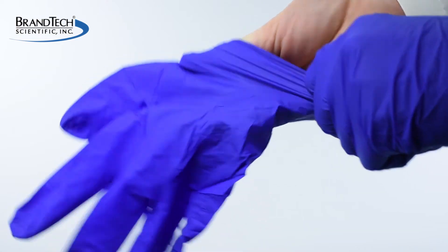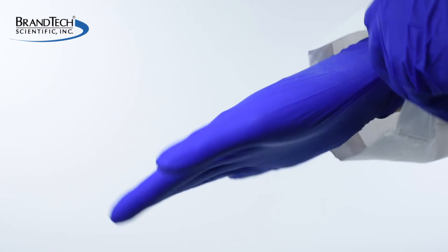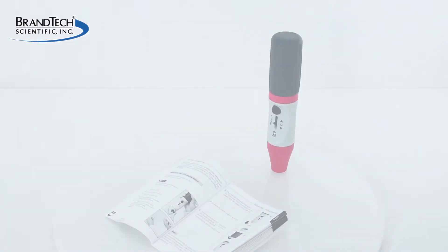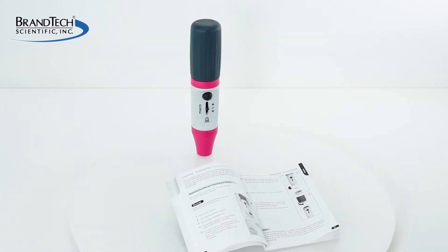When working with your Macro Pipette Controller, wear all the appropriate personal protective equipment and observe all safety precautions. Always refer to your operating manual for specific instructions for maintaining your particular model.